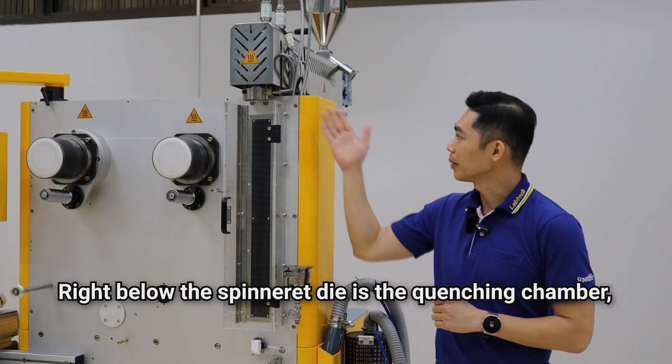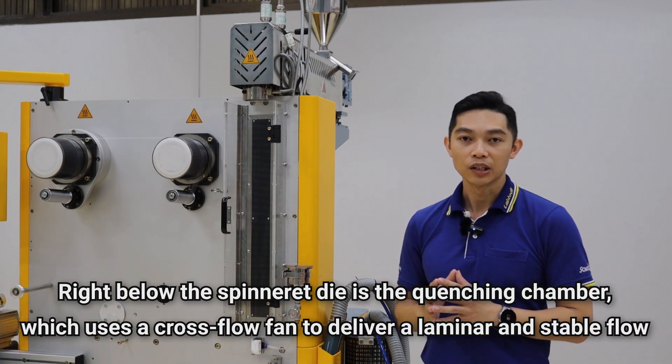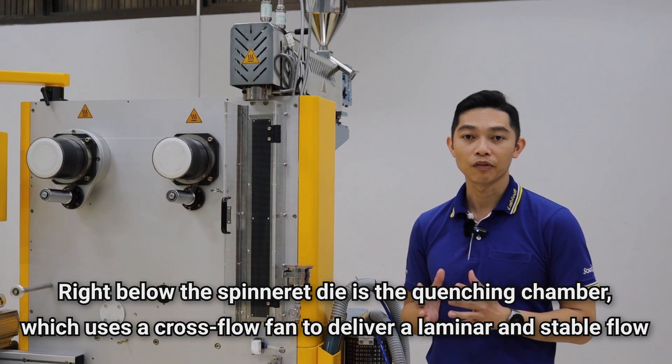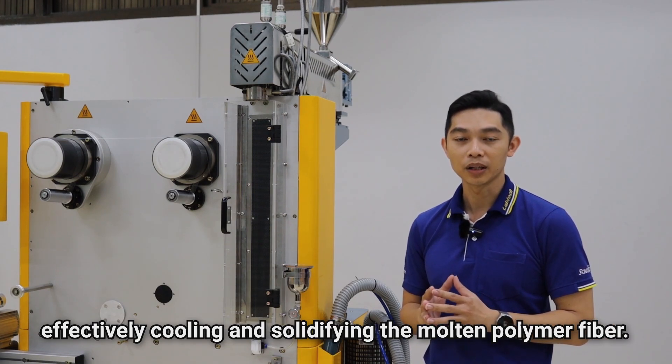Right below the spinneret die is the quenching chamber, which uses a cross-flow fan to deliver a laminar and stable flow, effectively cooling and solidifying the molten polymer fibers.